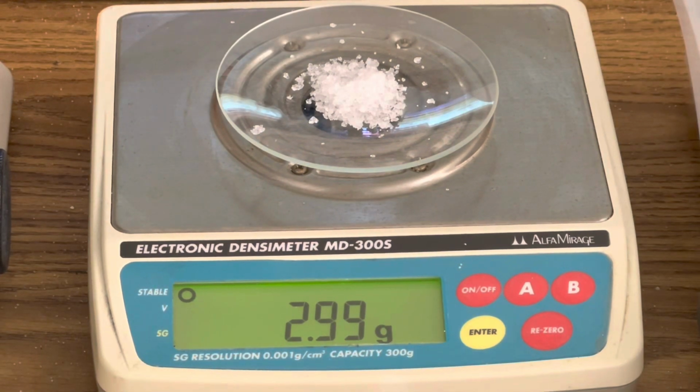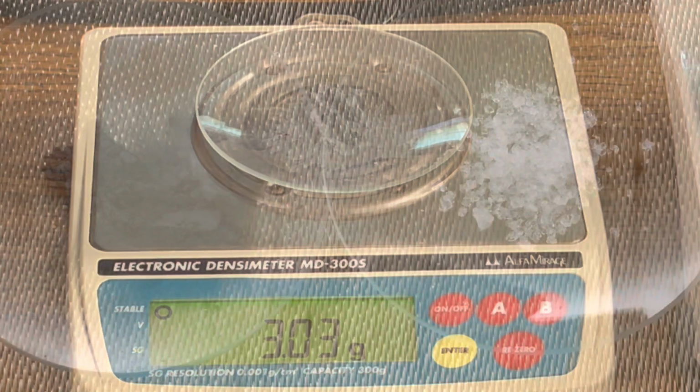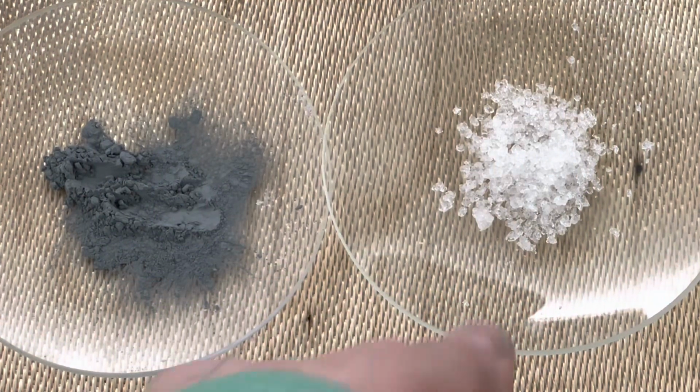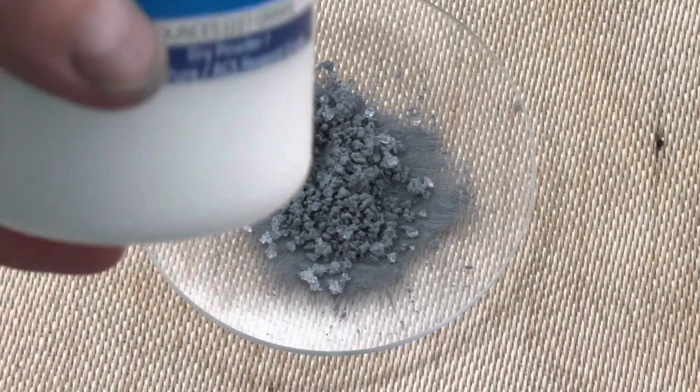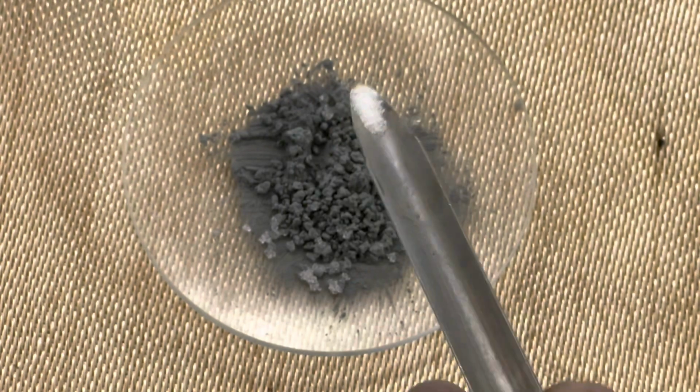Begin by measuring 3 grams of ammonium nitrate. Next, measure about 3 grams of your zinc powder. Next, start mixing the 2 reactants together. And now you're ready to add just a very small amount of ammonium chloride as a catalyst. And you're just going to mix this with your reactants.